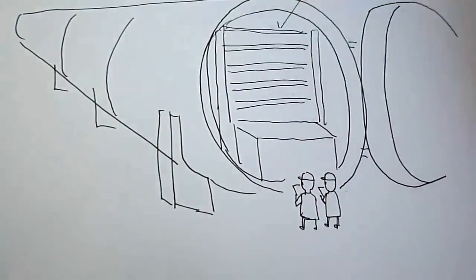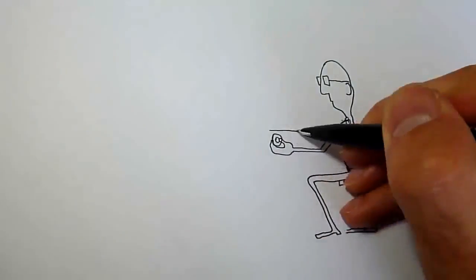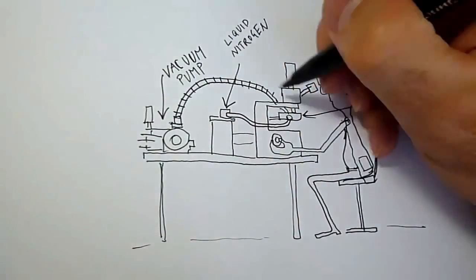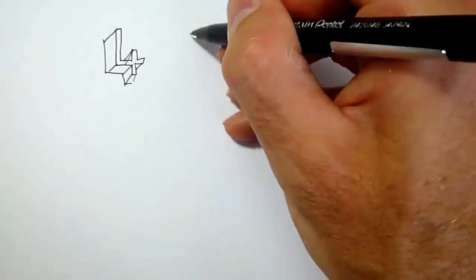Freeze-drying is an expensive process. In order to maximize the yield of the product, scientists can investigate the ideal conditions by recreating a freeze-drying cycle on a microscope using a mini version of a freeze dryer. There are 4 distinct steps in freeze-drying.